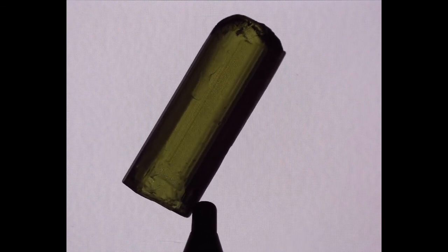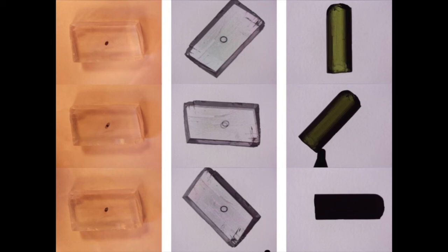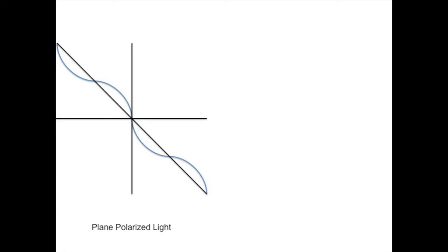As we rotate the tourmaline, the color gradually darkens until it is almost completely dark. Every 90 degrees the color goes from a maximum to a minimum — and recall that every 90 degrees when rotating the calcite we ended up with either the extraordinary or ordinary ray. That's not a coincidence. Plane polarized light vibrates in one plane. Anisotropic substances are defined by multiple indices of refraction; our tourmaline is described by two indices of refraction, which we can illustrate as two different directions.